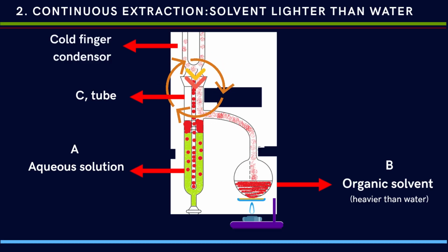Again, continuous heating of organic solvent and vaporization and condensation. This process continues until the maximum extraction of substances takes place with solvent.